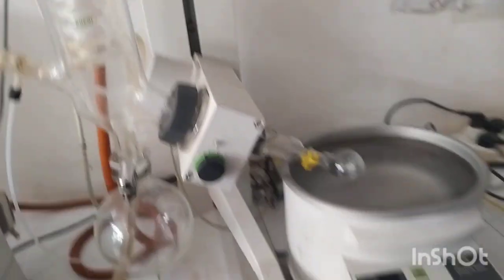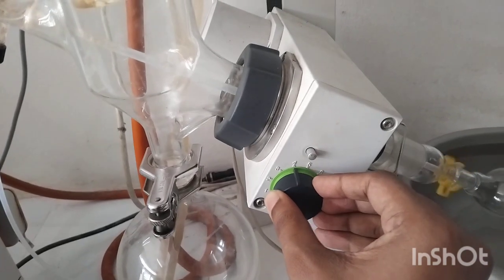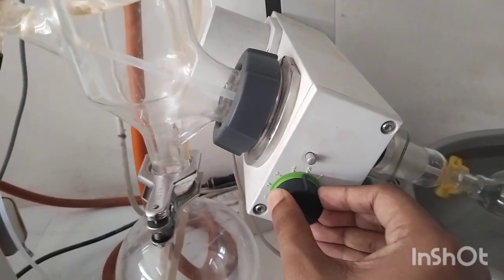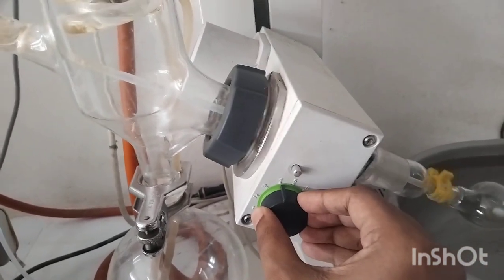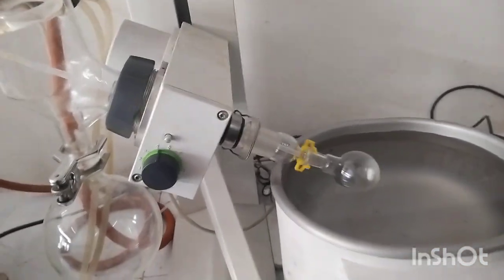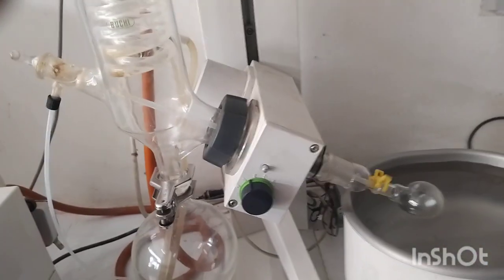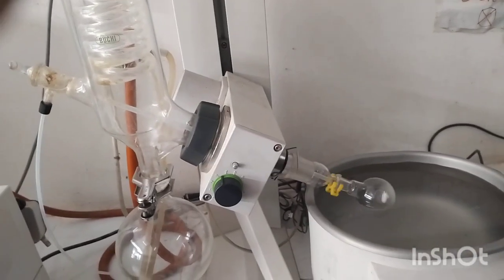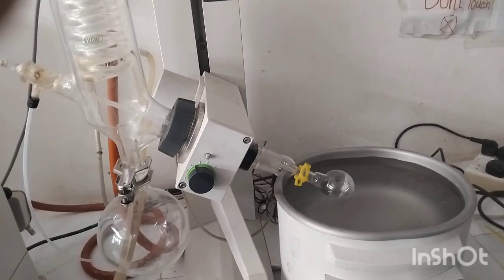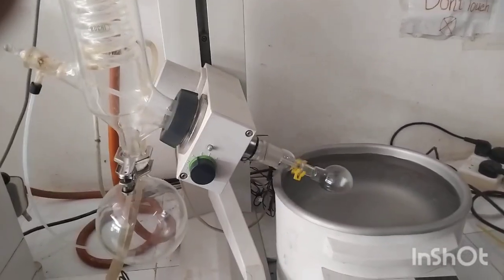And if you'd like to rotate the specific RB bottle in a higher range, then you can use this specific button. We can increase this button to 4, 5 or 6. When you increase this specific value, the rotation of this RB will be higher. When you decrease this specific regulator, then the rotation of the RB bottle will be lower. It totally depends on what kind of rotation you'd like to use for properly drying.